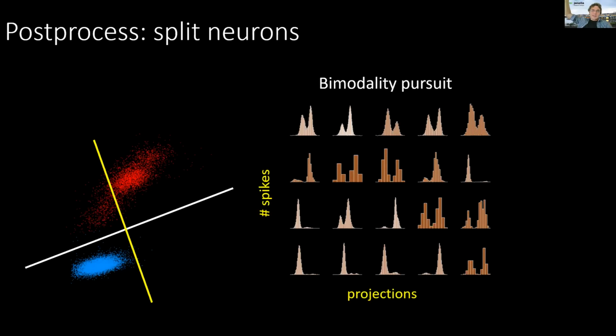Data that's elongated in particular dimensions might get split into halves, like a unit that's drifting up and down. It might just produce 3 different templates that track this unit's position along the vertical axis. And so it made it particularly easy to interpret the results by using a simple algorithm, especially because we didn't know very well the common sources of problems we might have.